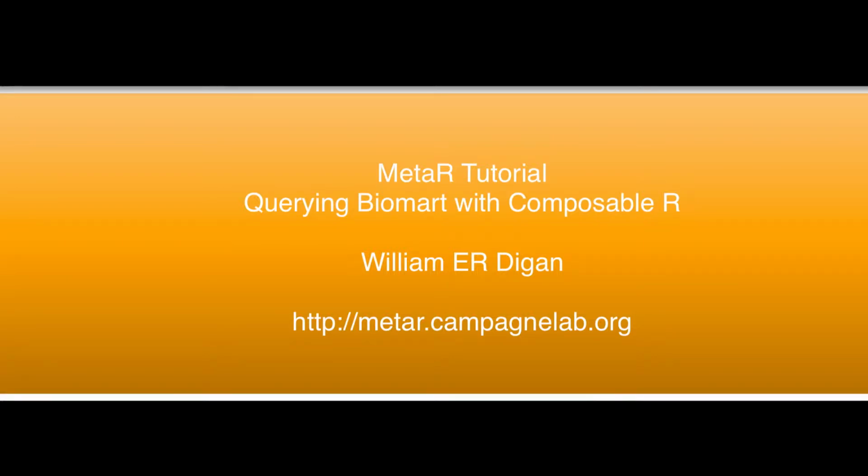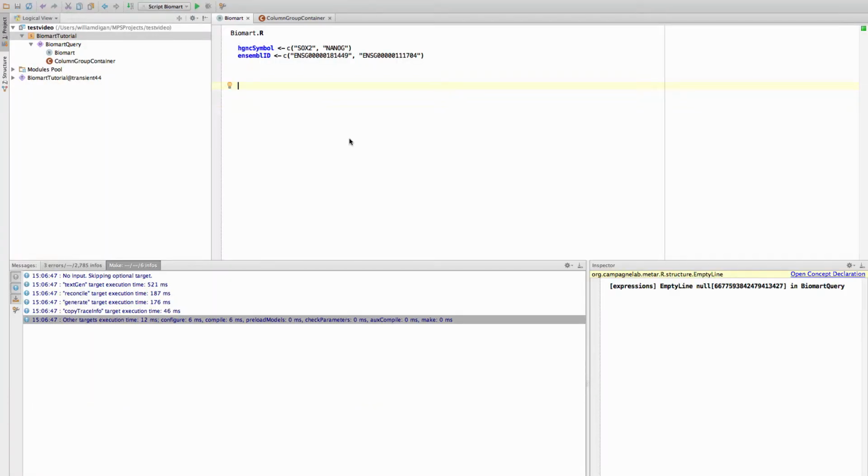Hi, my name is William and I will show you how to use the query BioMart statement of MPS inside an R script. This example is run under our Docker image, Rocker MetaR.